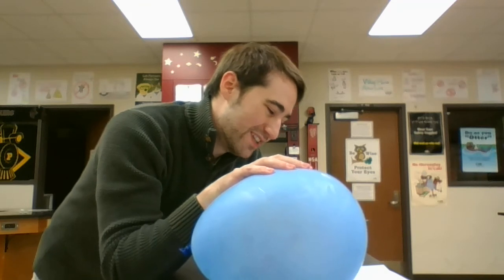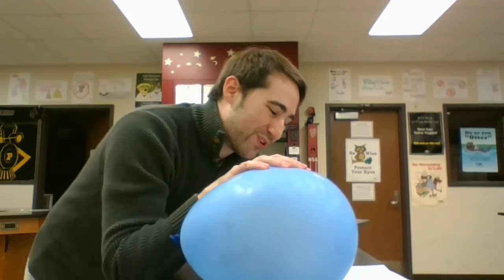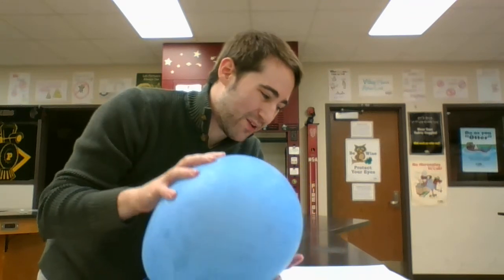So I can pretty easily convert this from 1,240 milliliters into liters if I just move my decimal point around in the right way. Again, going from milliliters to liters. And that's the last station, the balloon I breathed into.